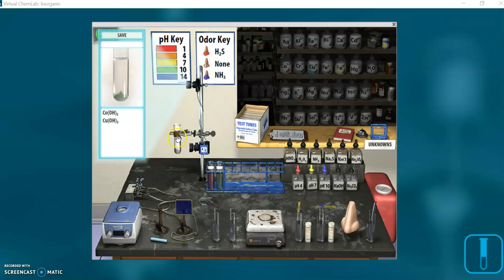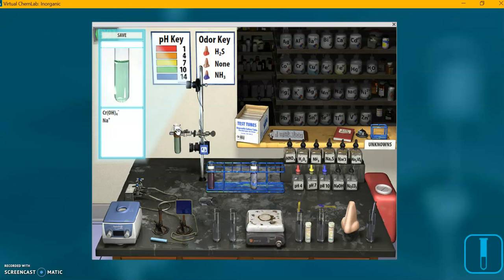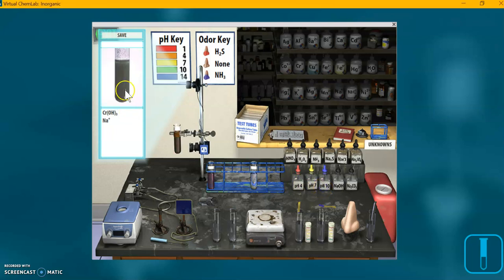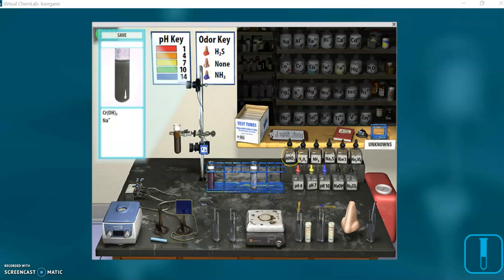We can confirm that. Let's move this out to our test tube rack. To confirm chromium, we're going to do a test — I'm going over to the pH 10 and clicking it; it immediately goes into the test tube. We've got a black, dark, cloudy precipitate there — that is evidence that chromium is present. For further confirmation, I'm going to the reagent shelf and clicking the nitric acid. Watch the zoom screen — we have a clear purple solution, and that shows us that chromium is present.